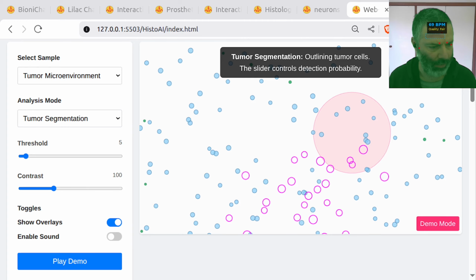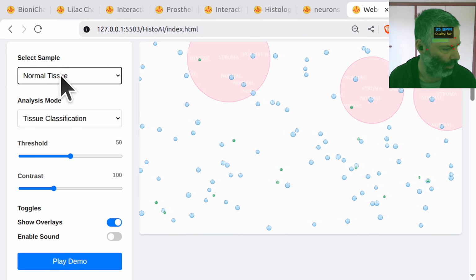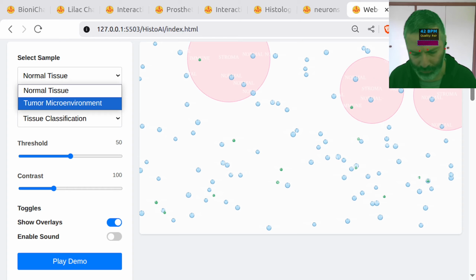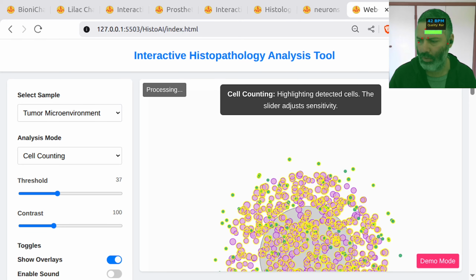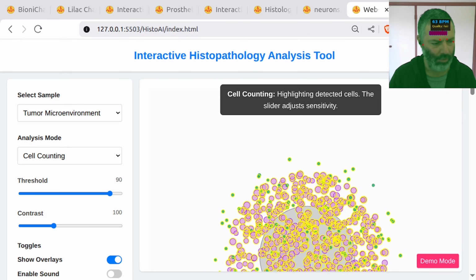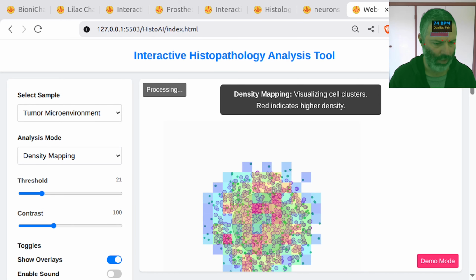Okay, it's still invisible. Okay, there's something there. Oh, I need to fix the code. Okay, it's there now. Don't get it. Need to fix the demo as well.